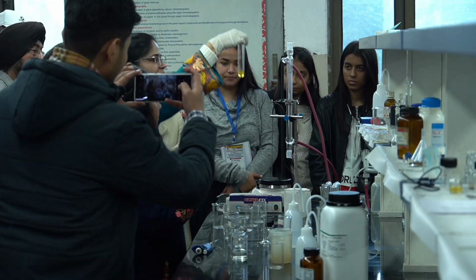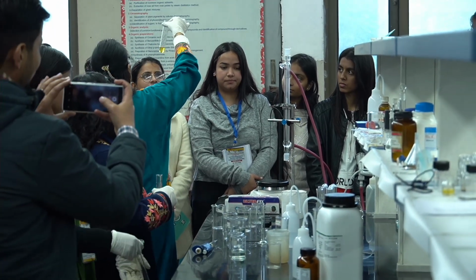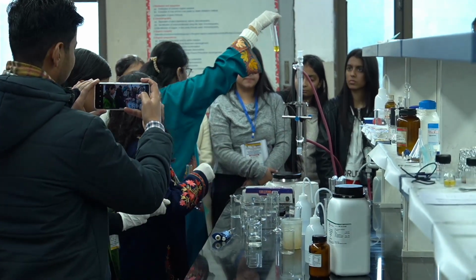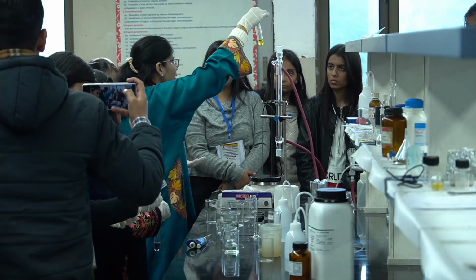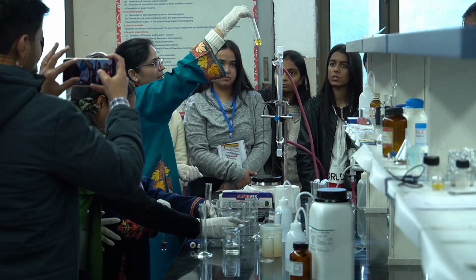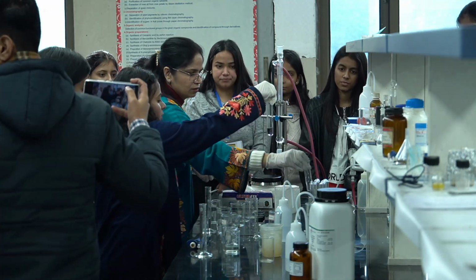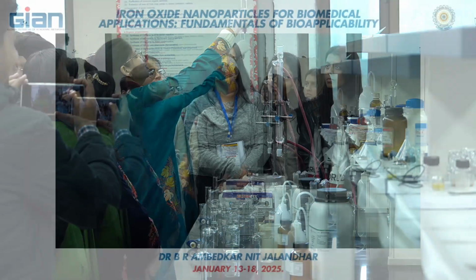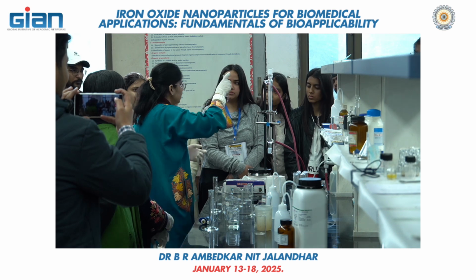We have already synthesized the silver nanoparticles, and you can see this is quite stable; they are not settling. This one is gold.